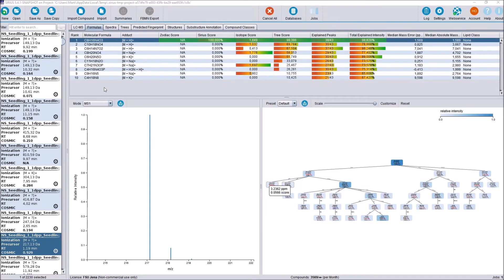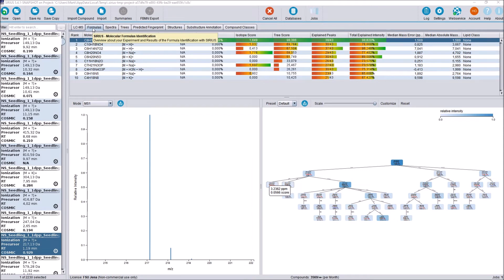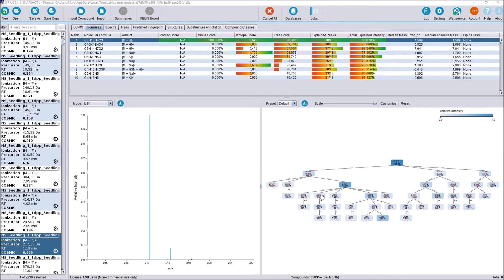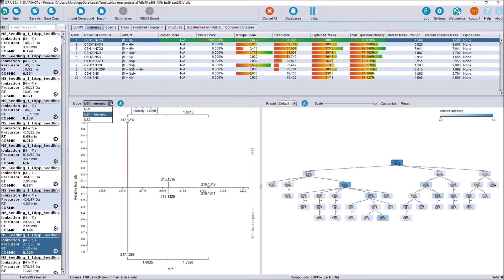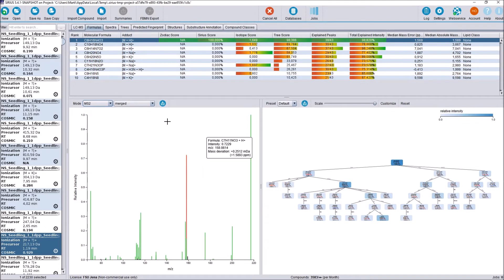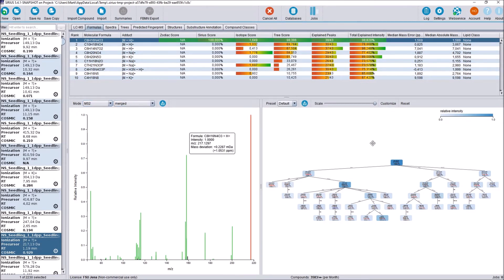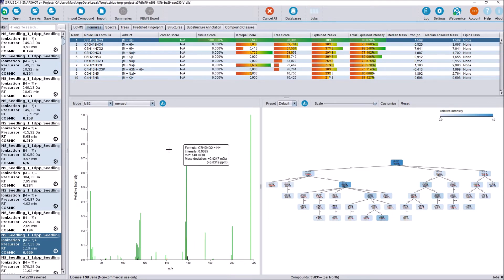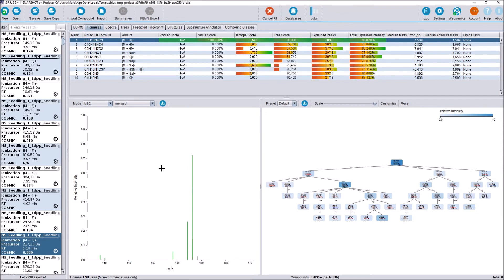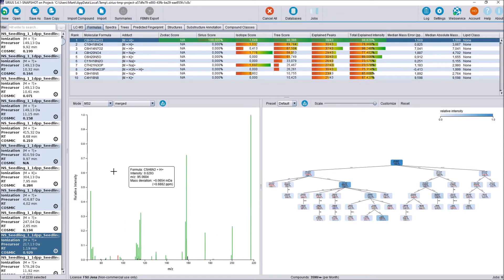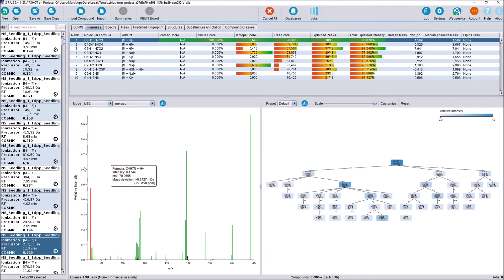Now that our computation is partly complete, we are going to take a look over the tabs here in the result ribbon and how they changed. First, the former SIRIUS Overview tab is now called Formulas to more accurately reflect its contained information. The content in here didn't change. You still have the ranked list of molecular formulas, a spectrum viewer where you can choose to view the MS1, MS1 mirror plot with the isotope pattern prediction, and MS2 spectra, and you still have the fragmentation tree on the right here. Note that you can navigate these viewers by zooming by holding right-click and selecting an area, resetting the zoom by double right-clicking, and you are also able to scale the y-axis here by hovering over it and using your mouse wheel.